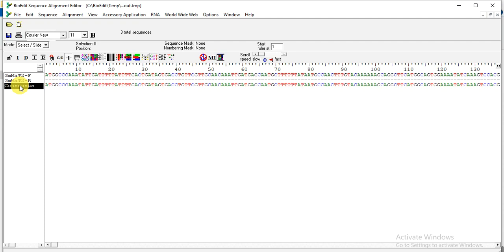When we get that alignment 100% okay, then we can say that our cloned gene is right, and we can use it in further expression analysis or any other analysis to characterize that gene functionally or experimentally.